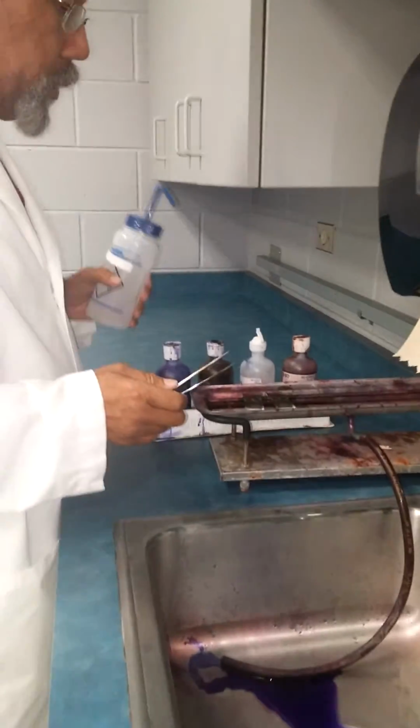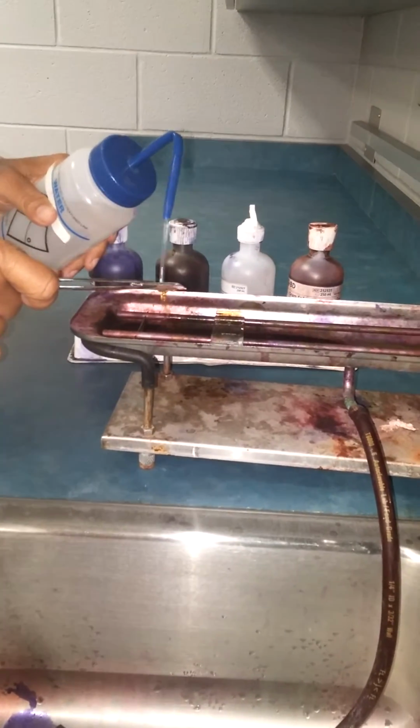So after the appropriate time period, we're going to rinse off the iodine.